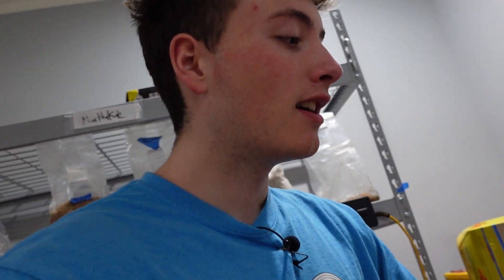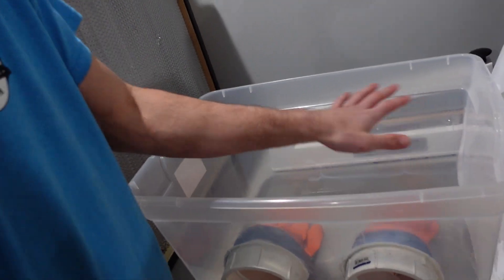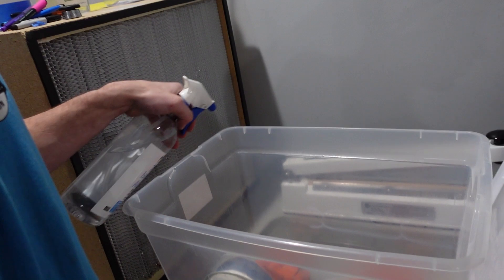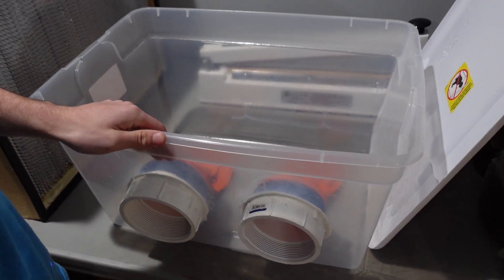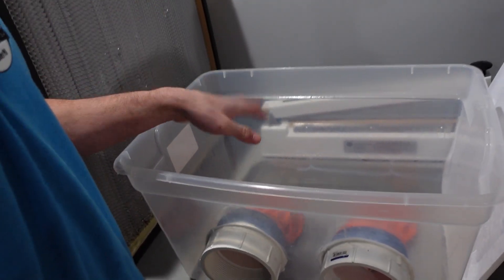There are going to be particles and bacteria floating around that may get inside. What I do is suds the box up with soap all around, and I also spray it down with isopropyl alcohol — I'll spray down all the sides of the box. Then I let that dry, clean it out, clean whatever was in there out, then put soap all around the sides, and then put the lid on. Then I'll also spray down whatever I'm going to be working with and put it inside of the box.